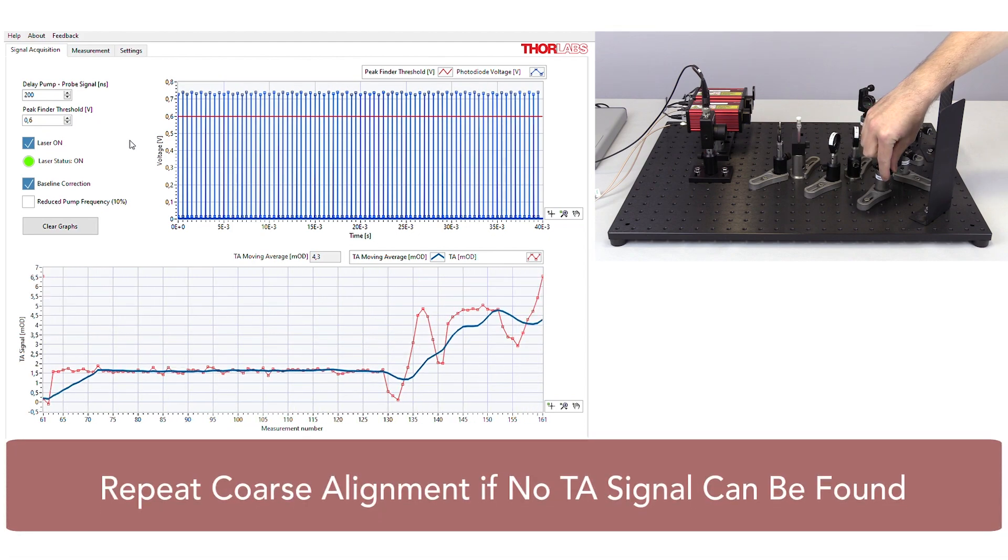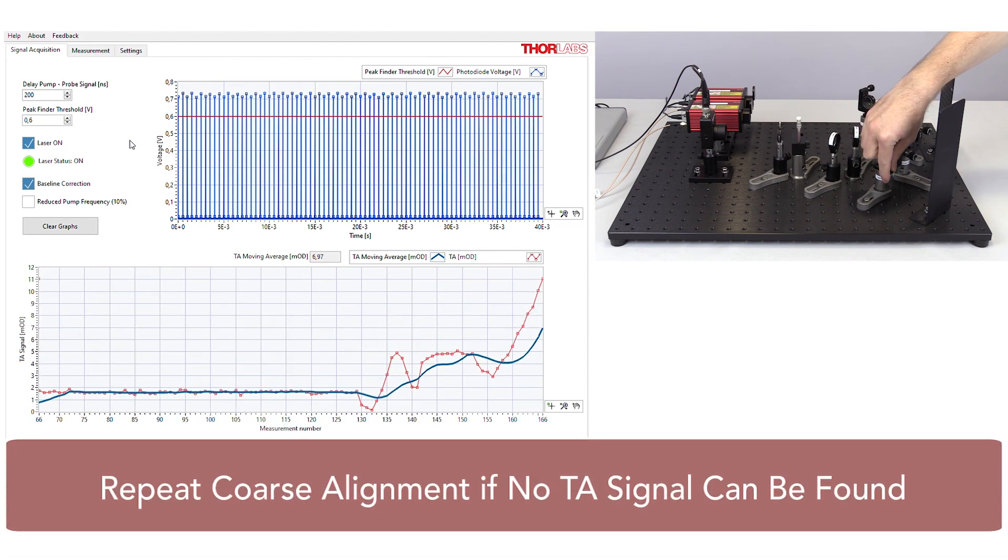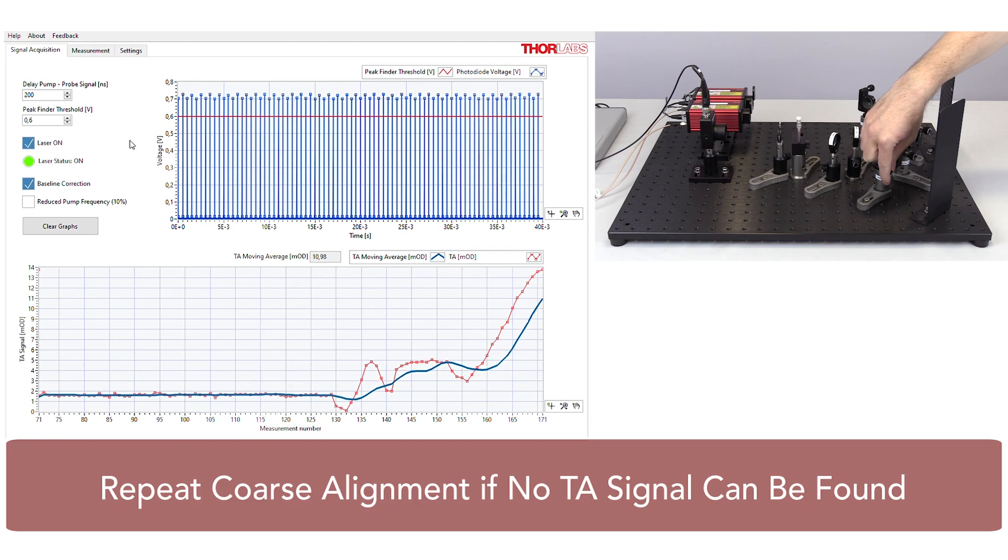If the signal is no longer visible at this point, replace the sample with the detector card and repeat this procedure.